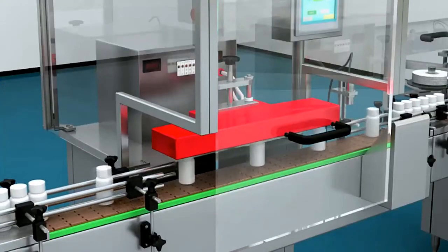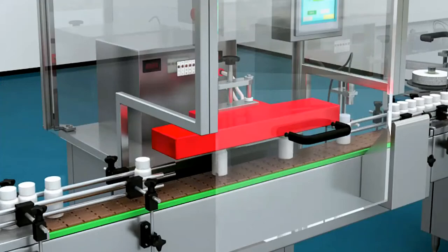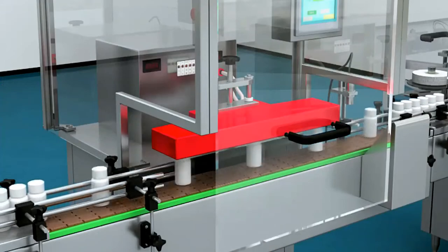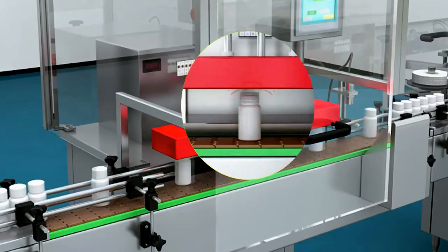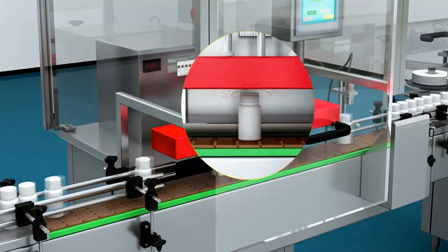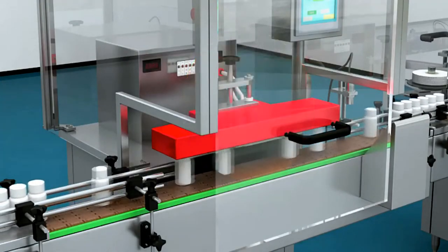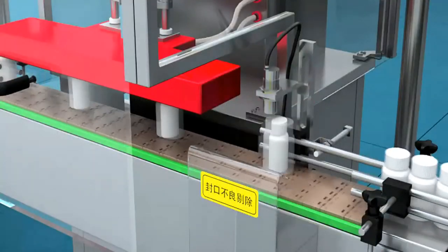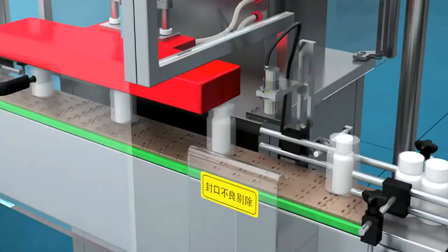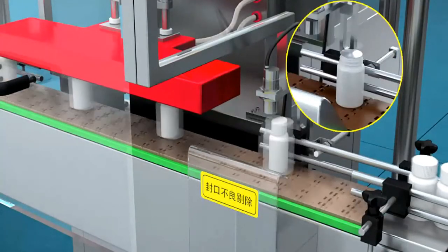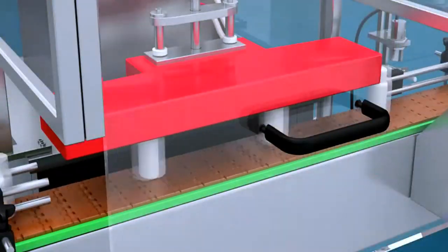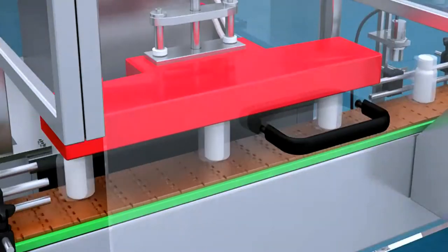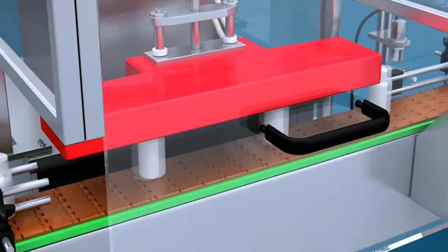The capping machine is composed of mechanisms such as lifting, arranging, capping, delivering, and rejecting. The bottle is automatically capped after entering the work position and then delivered to the capping machine to screw the cap through three pairs of capping wheels.